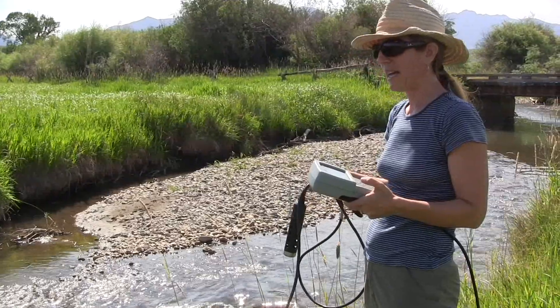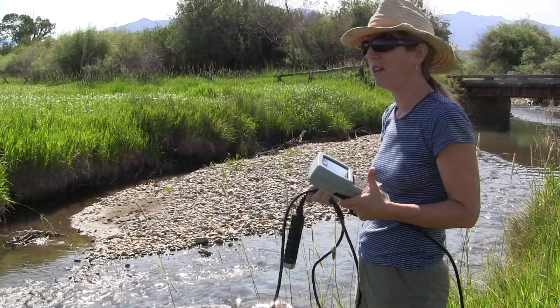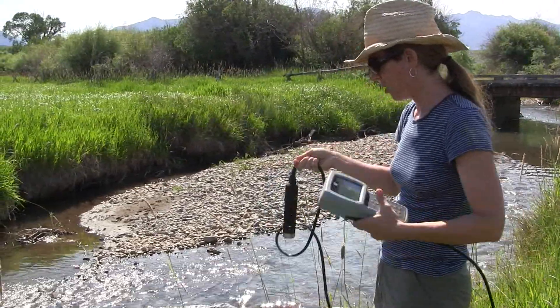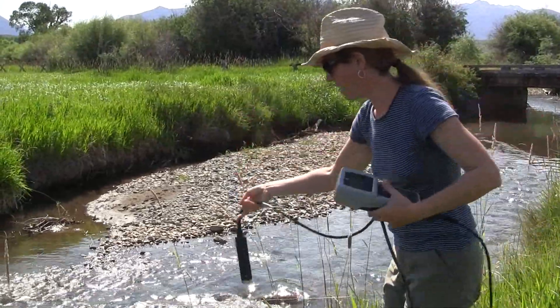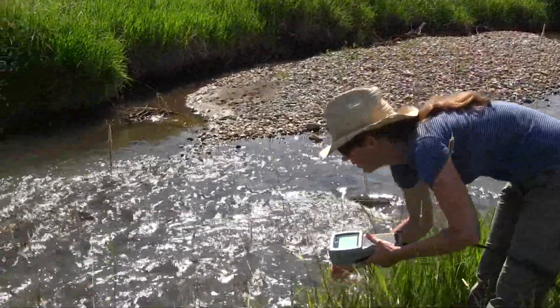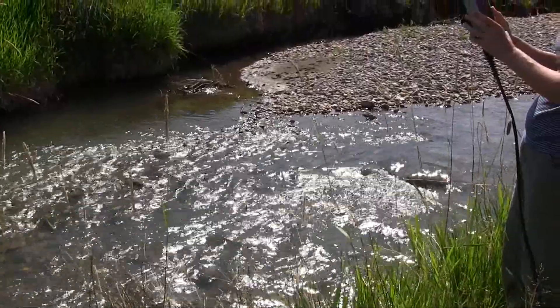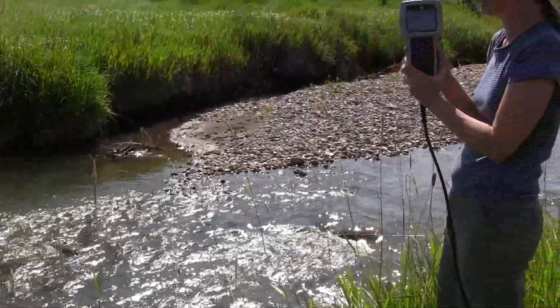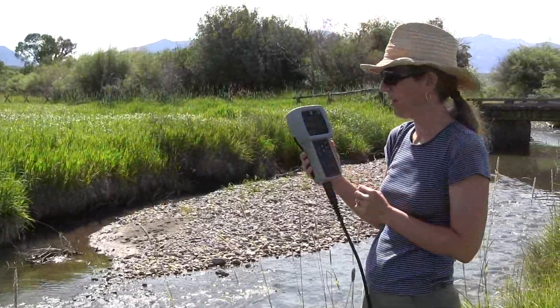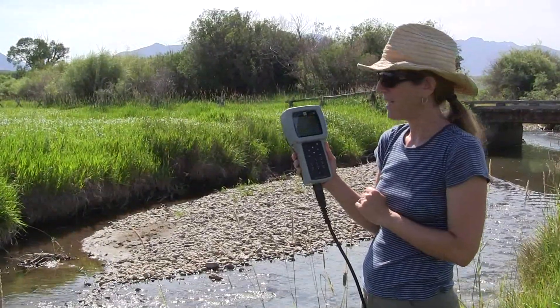Once you're ready to take your readings, find a spot in the stream at your site with good flow where you're upstream of any teammates who might be disturbing the water. Gently place the probe in the flow, then turn it on and make sure it's running. Give it about 10 minutes to settle in on its numbers, and once it's equilibrated you can write down your readings.